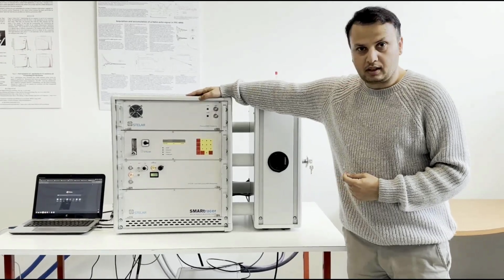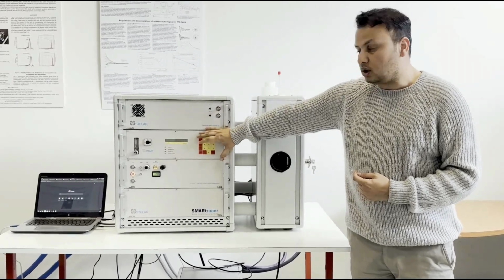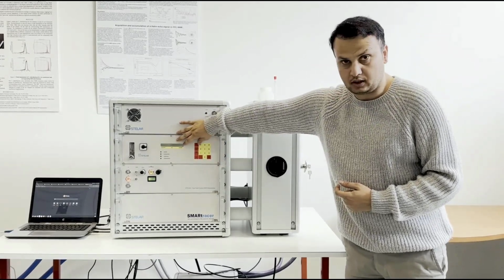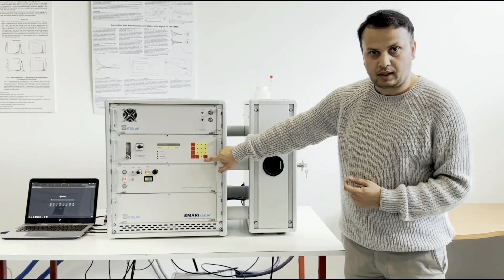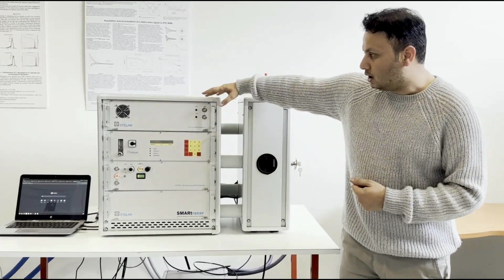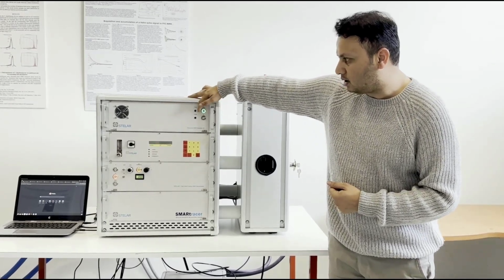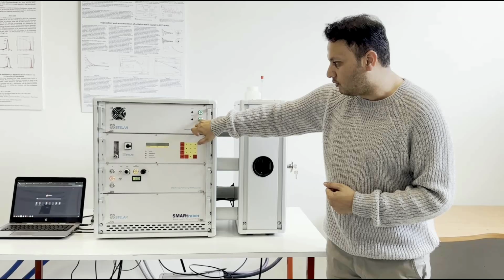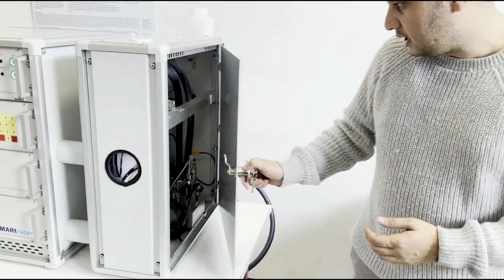This is the main part where we have our NMR console and also a console to control the temperature of the sample, and this is called the VTC or variable temperature controller. This controller can be operated manually by the user from here, and also it can be controlled by the software. Then this is our NMR console. When the instrument is connected to the power supply, we just have to switch it on from here. The console is on. The next part is to make sure that the transmitter is on, which we can do from here.